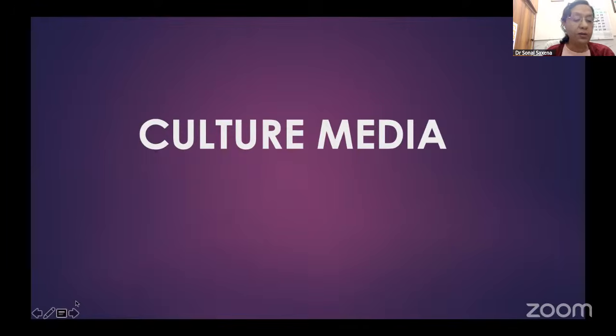I'm going to talk about the culture media, the very, very basics of what we call the kitchen of microbiology. My guide was very fond of this statement when he used to tell me that it is the kitchen which determines how good a microbiology department is. Now, most of our laboratories have shifted to ready-made media, whether for culture or for biochemicals. And for identification, many of us have also gone to what we call automated systems, using Vitek or using Maldi. And so the technicalities of biochemical reactions and of culture media are not very clearly understood.